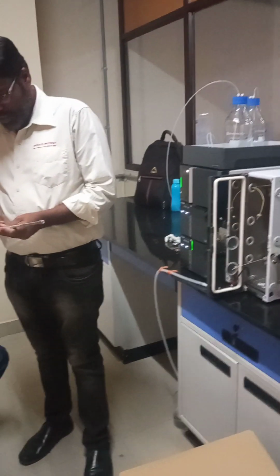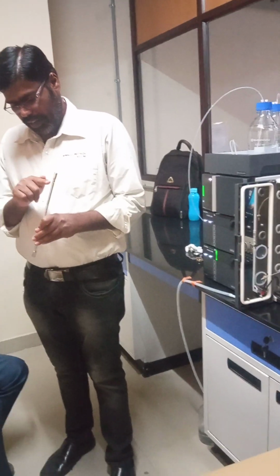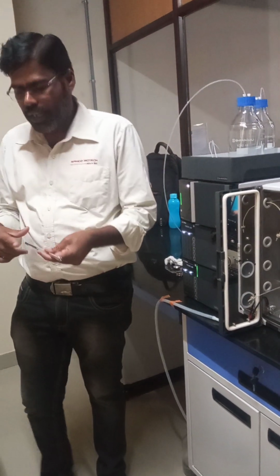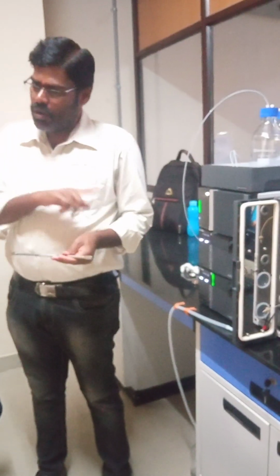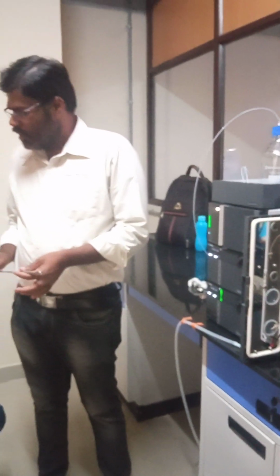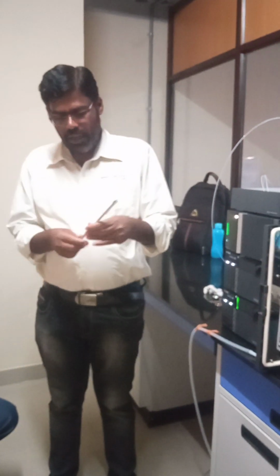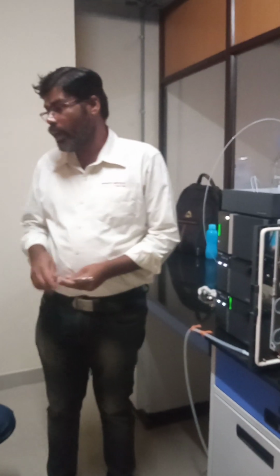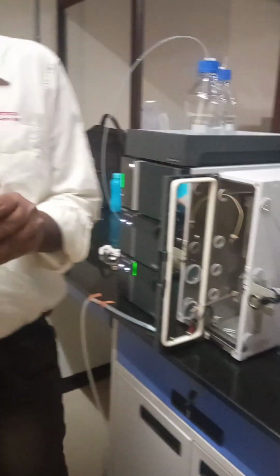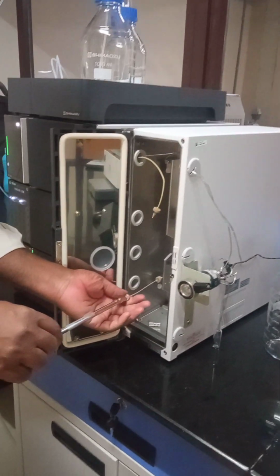This is the out, this is the in. Always in, and this is the out, always towards the outside, the detector side. This is a 250 by 4.6 column. Any micron and any vendor is applicable, not only Shimadzu. Any type of column is applicable; we just need to buy the column required for the application. Today, based on your application, you are telling chiral application. The upper side is the detector inlet. Just see, for example, rotate it.